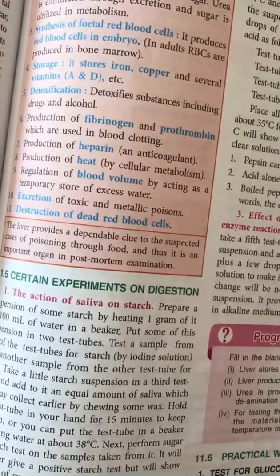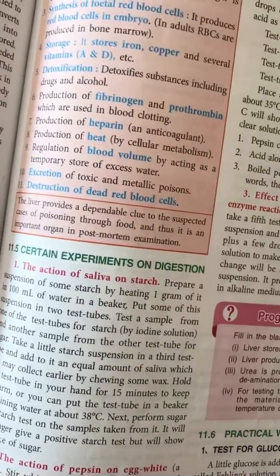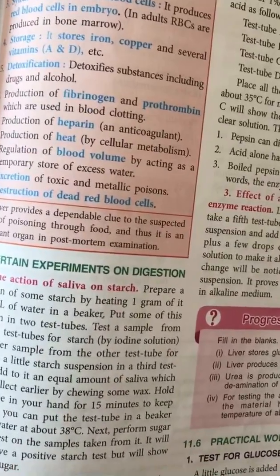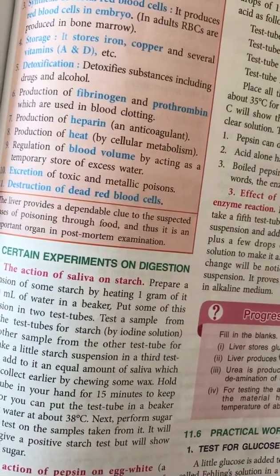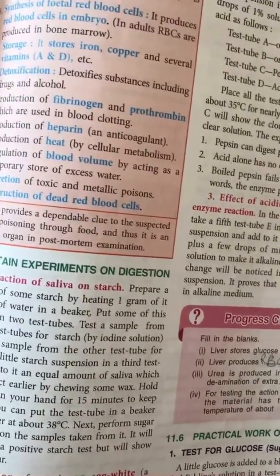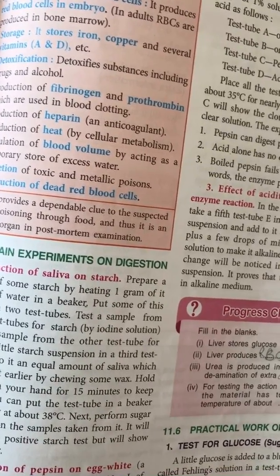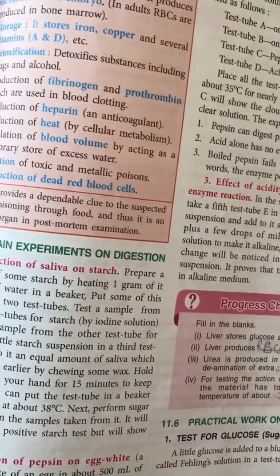Then take a little starch suspension in a third test tube and add an equal amount of saliva to it. And this saliva you can collect earlier by chewing some wax. Hold this test tube in your hand for about 15 minutes to make it warm, or you can put it in a beaker containing water at 38 degrees Celsius.